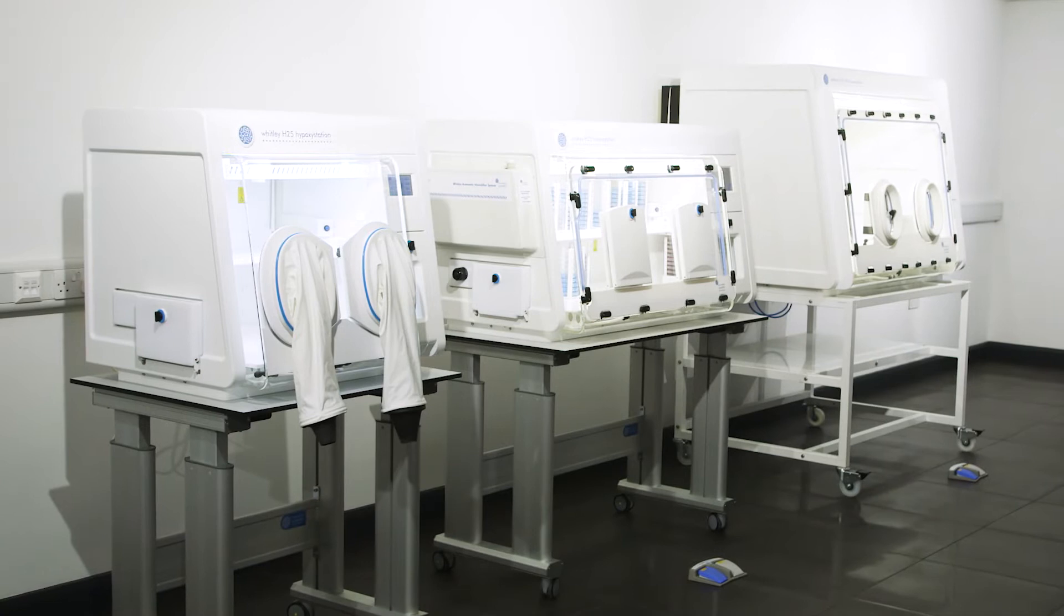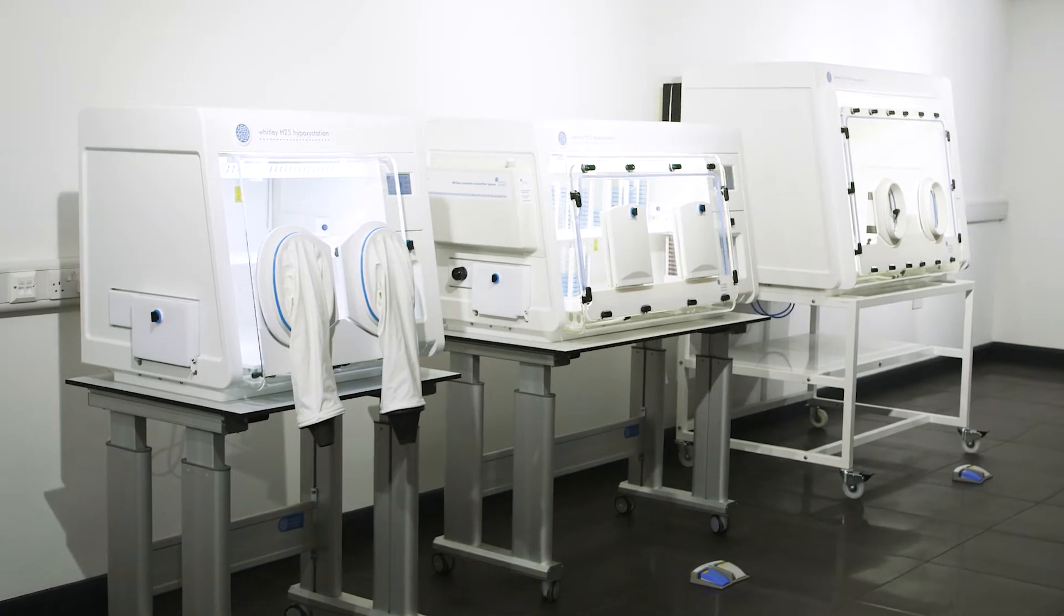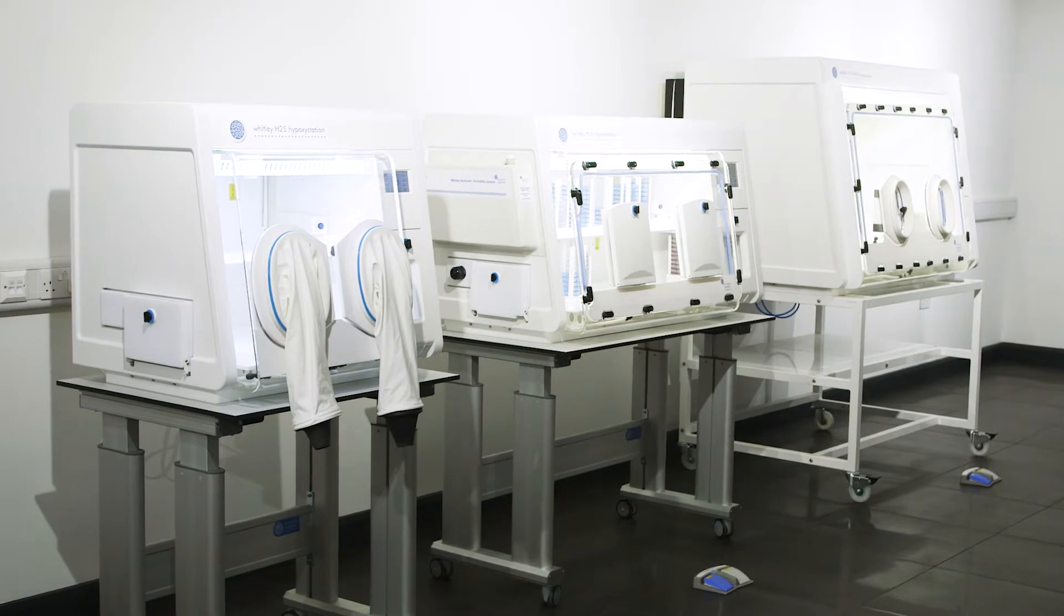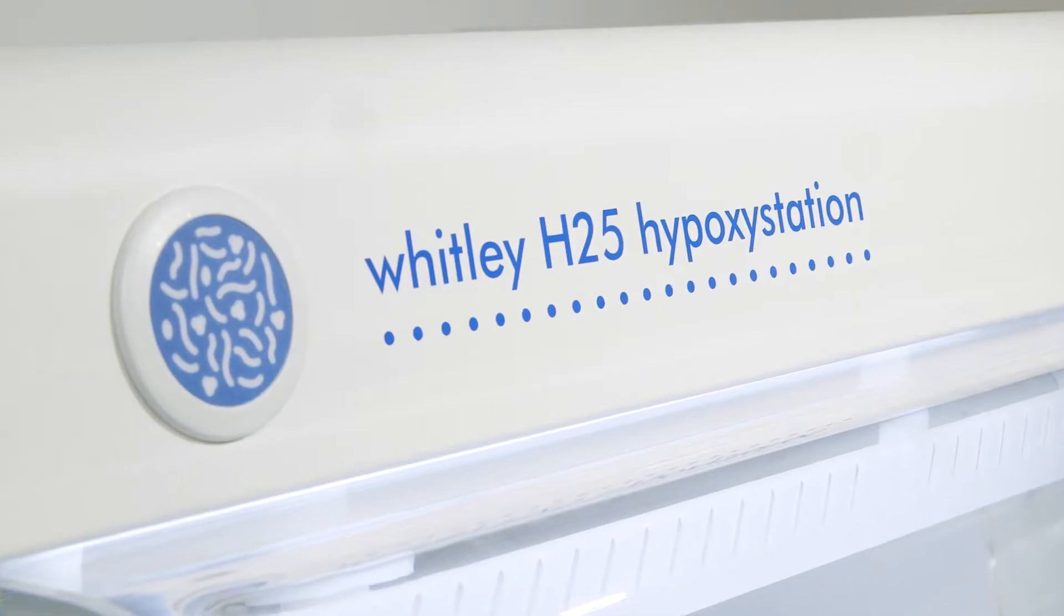Don Whitley Scientific has launched the Whitley H25 hypoxie station which creates and maintains physiologically relevant conditions within a controlled and sustained workstation environment.